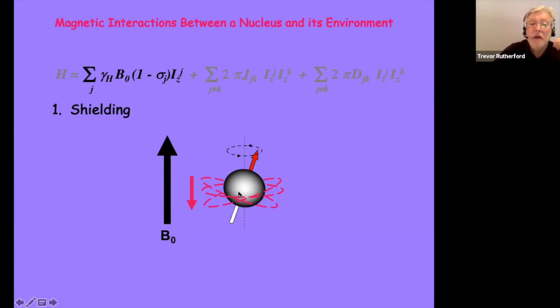obviously dictates what its spin frequency is going to be. And we can infer a huge amount of detail about the electronic structure, the electron density that is around each of the nuclei. So by far the dominant feature of the NMR spectrum is the functional group chemistry, the local composition of each of the centers.